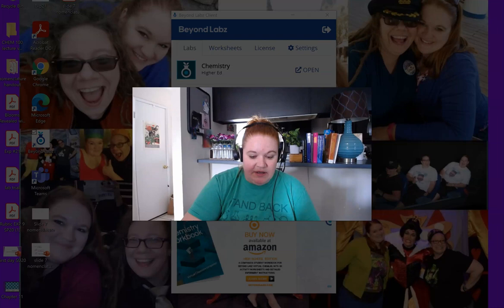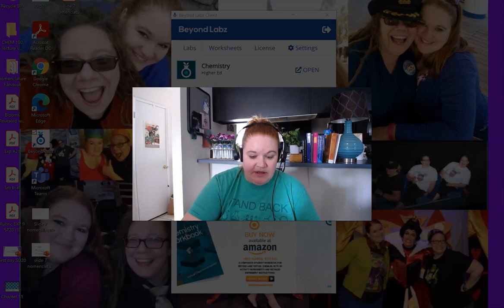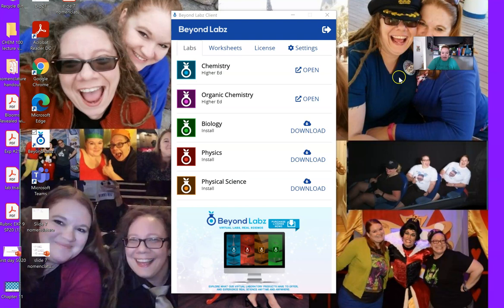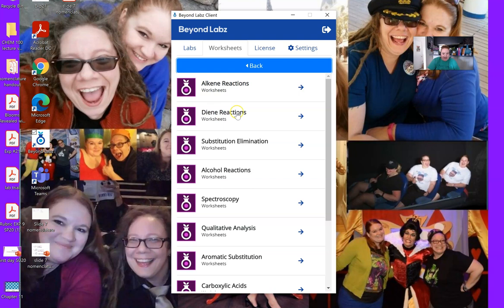So I'm going to start by opening up my Beyond Lab software. And I'm going to minimize my screen. And on this, I'm going to start by opening up the worksheet. So in the diene section, I'm going to go to Diels-Alder 1.